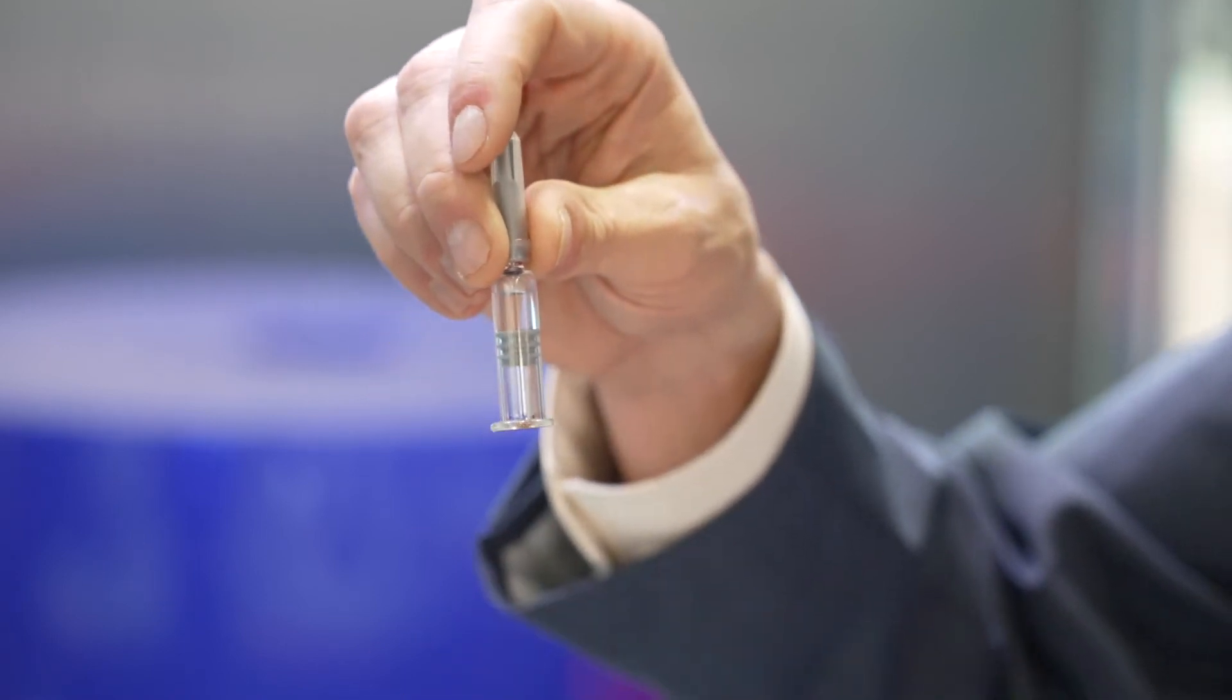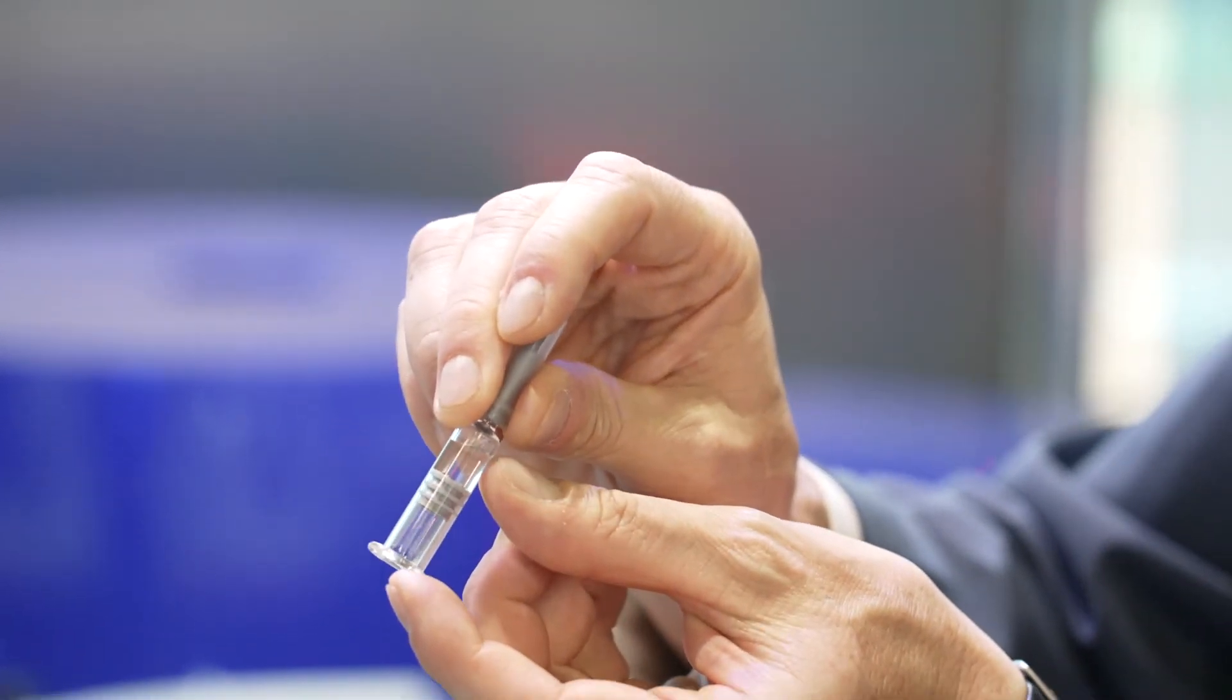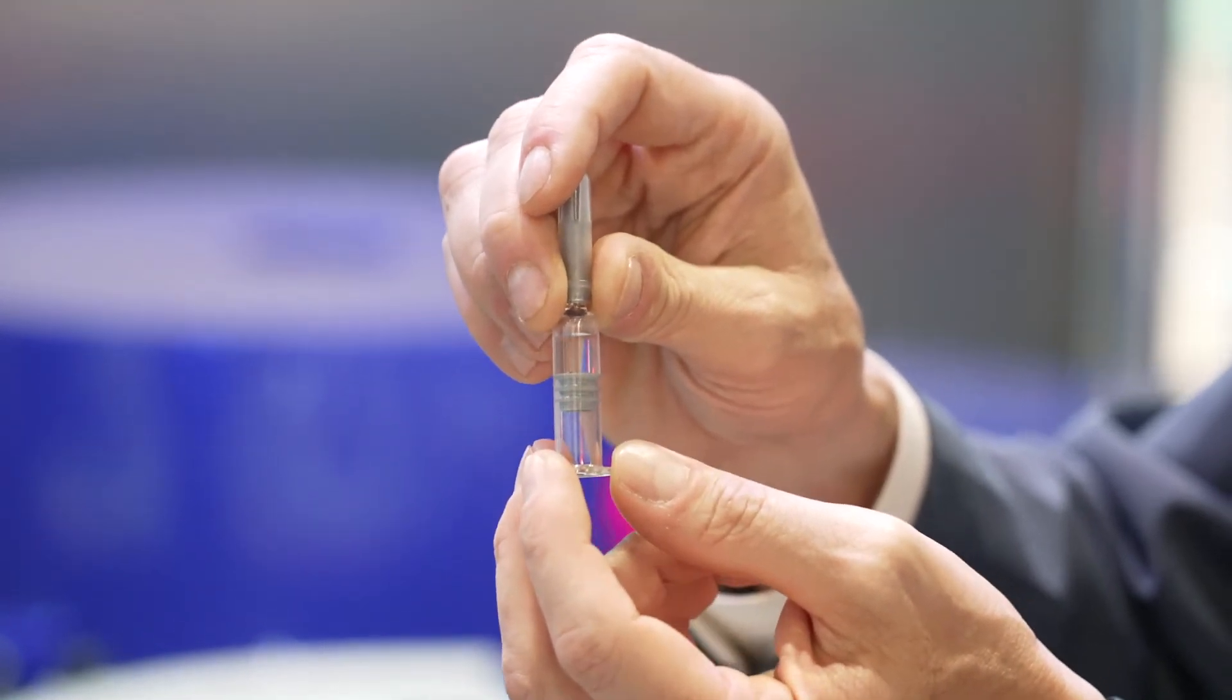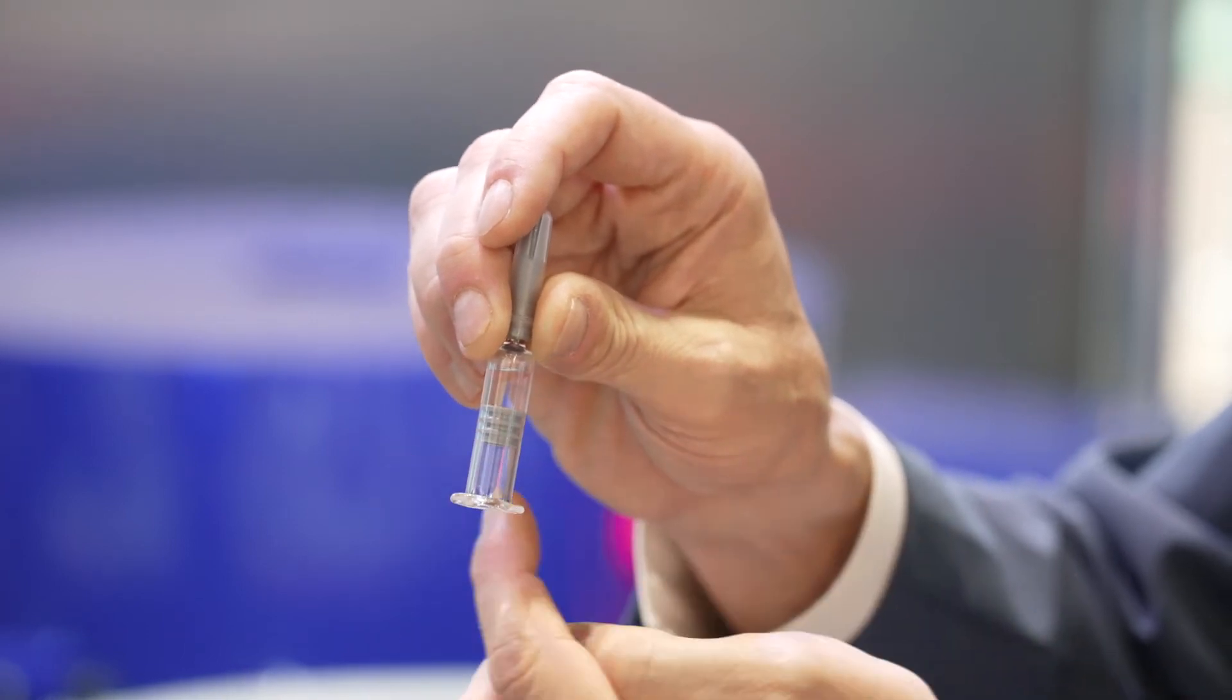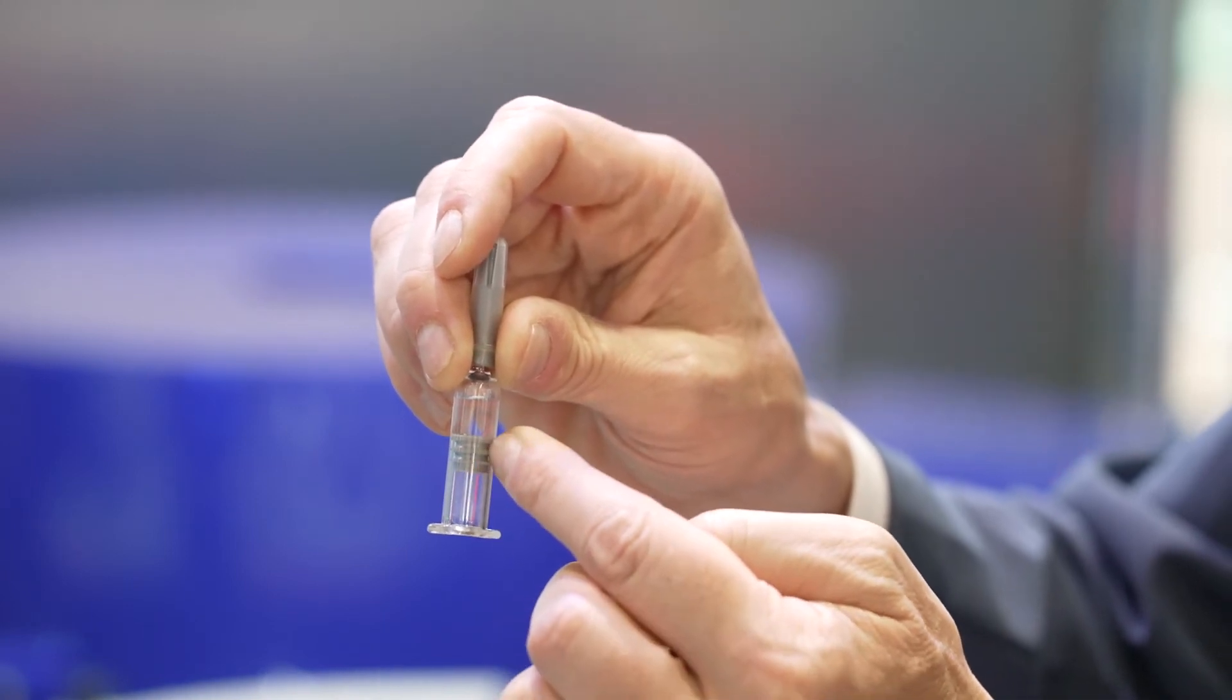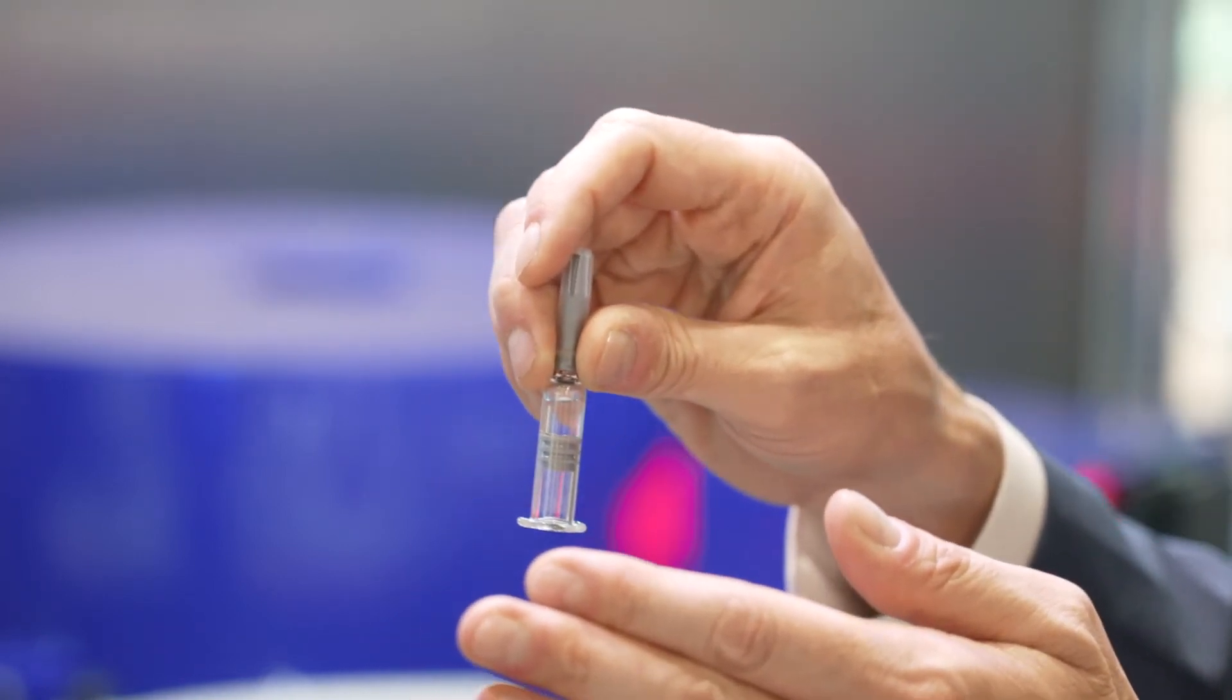And the last inspection after exiting the carousel is on the bottom, on this part of the syringe, because this part can be hidden in the carousel because of the gripper. So in this area, it is completely free and we can inspect this part for non-moving particles or defects or again the stopper in case the stopper is too low. Then the inspection process is finished and the container moves out.